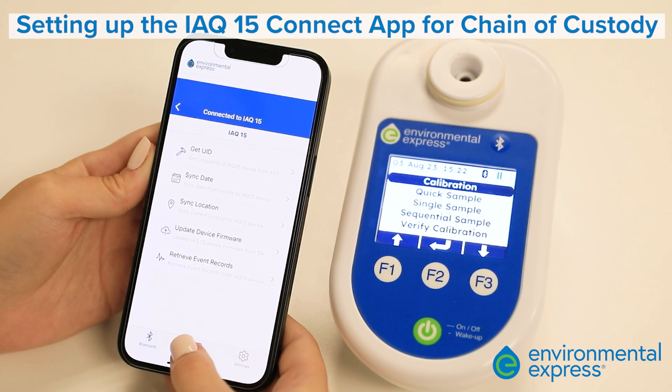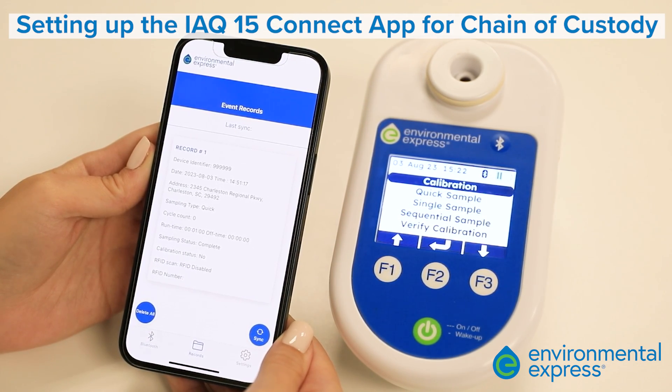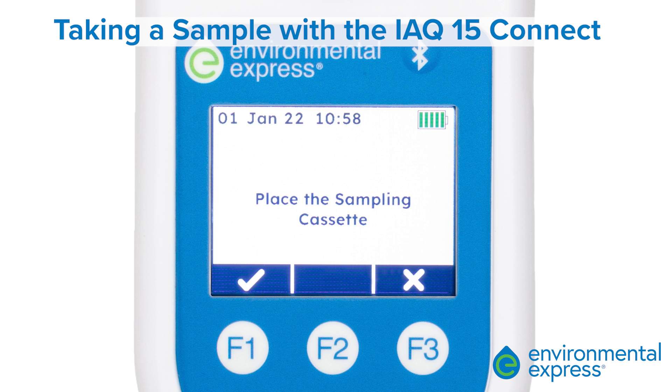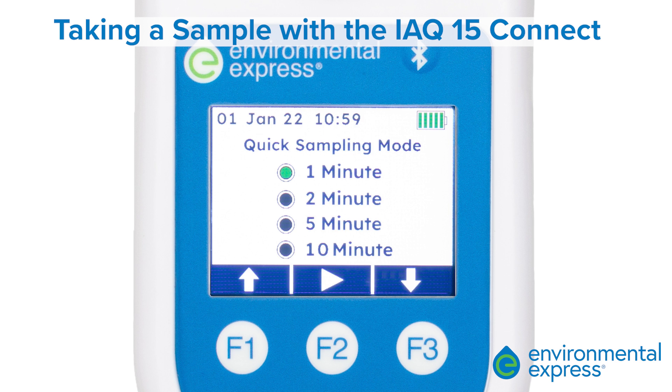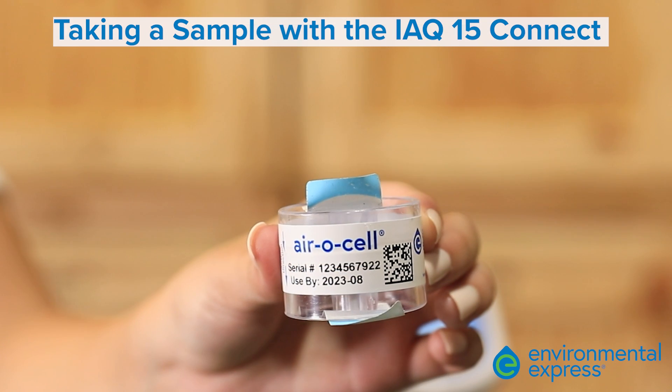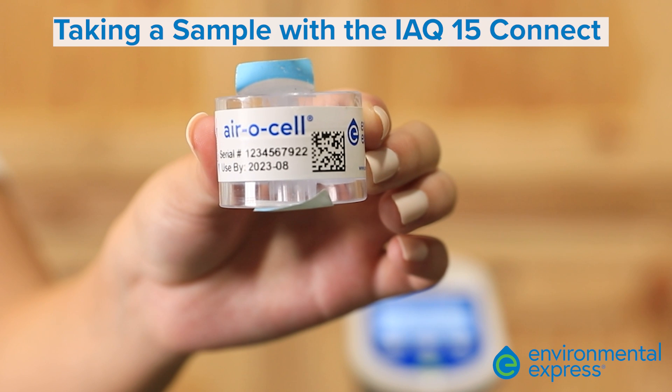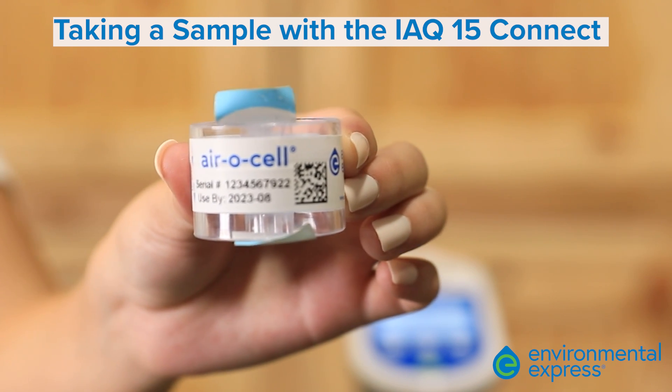Sampling records are stored as they are taken in the field and accessible for future use. In the sampling pump main menu, use the arrows to navigate and select quick sample using the middle button. The screen will then prompt you to place the sampling cassette onto the IAQ15 Connect. On the next screen, select the one-minute sampling option. Collect your aerosol and verify that it is within the expiration date and that it is a certified Environmental Express aerosol sampling cassette.